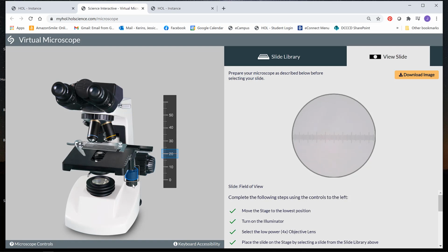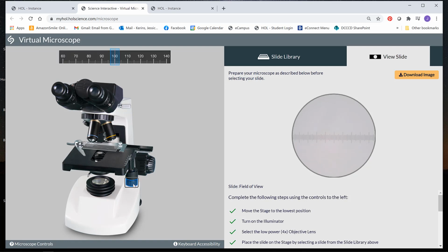And I like to line it up so one of those larger hash marks is all the way up to the left edge of the field of view. And so those are your, oh, and I see, well, I lost some at the right. So let me fix this. Let me go back. Let me do this.